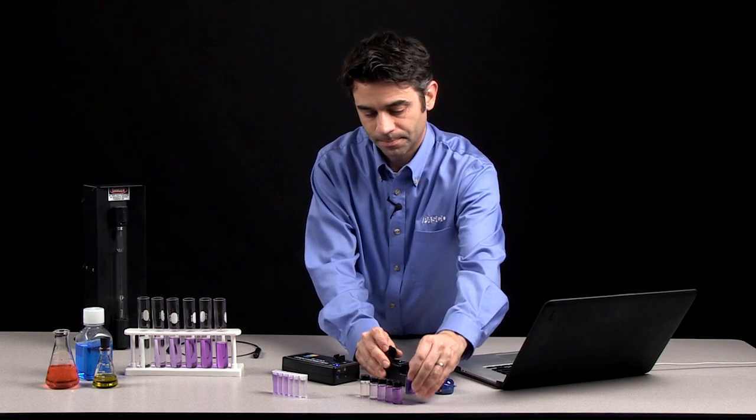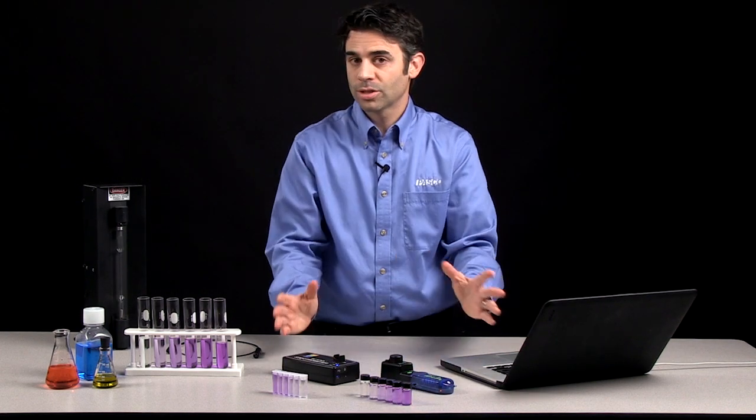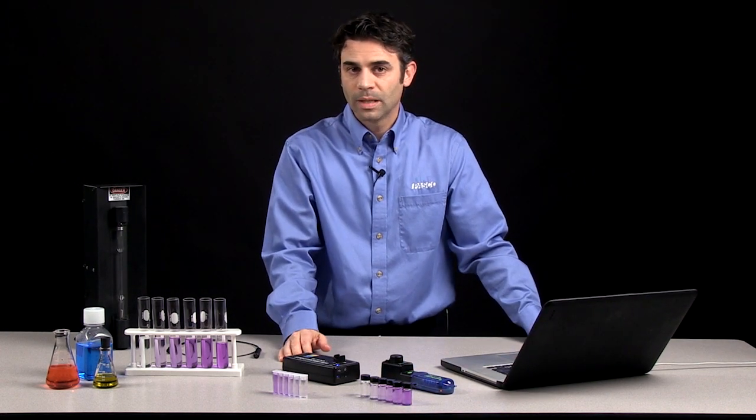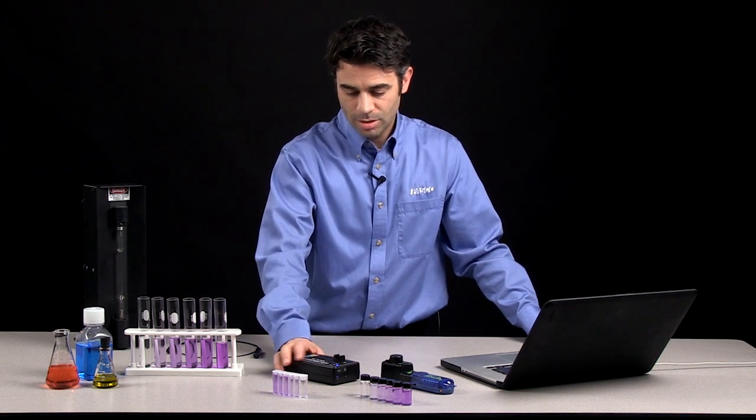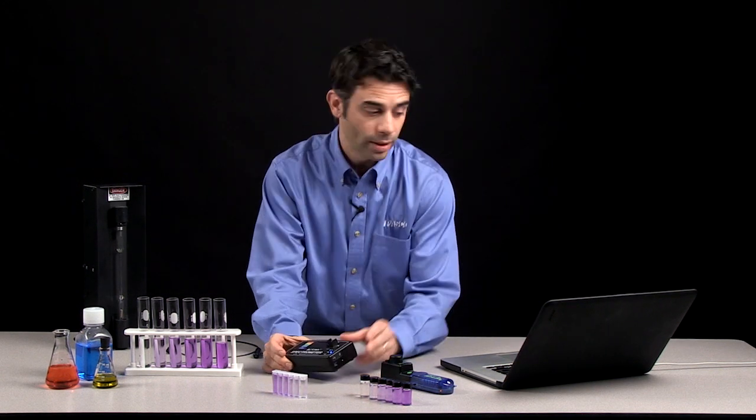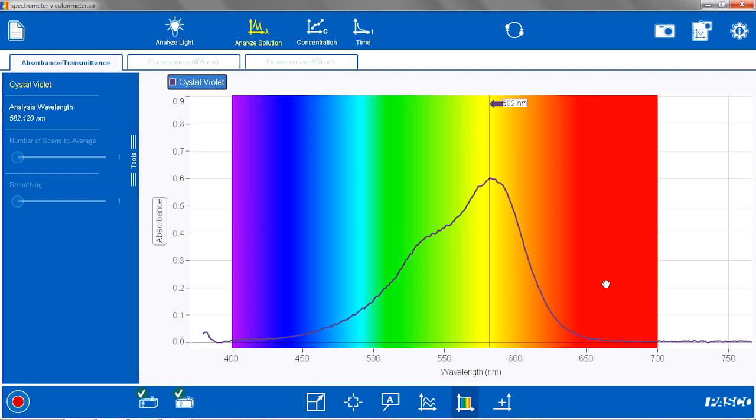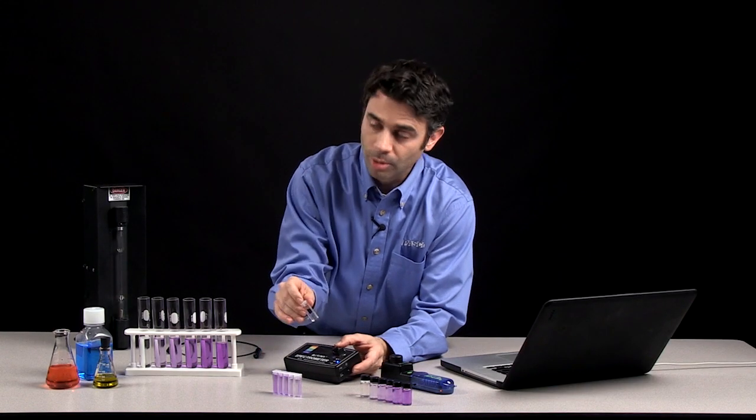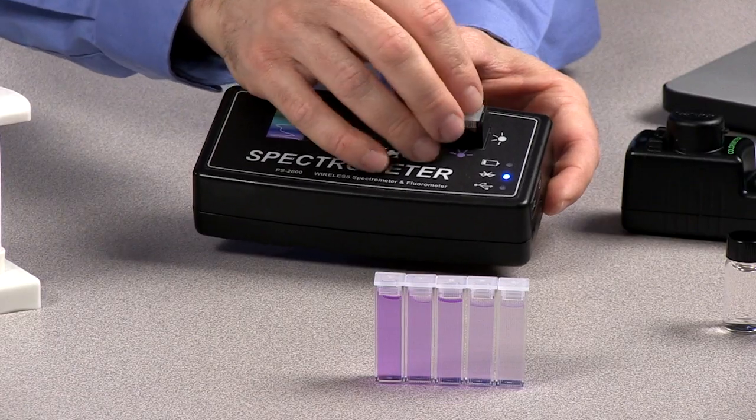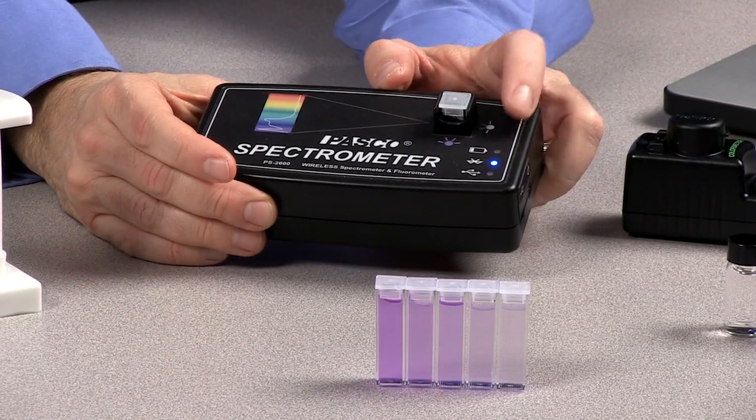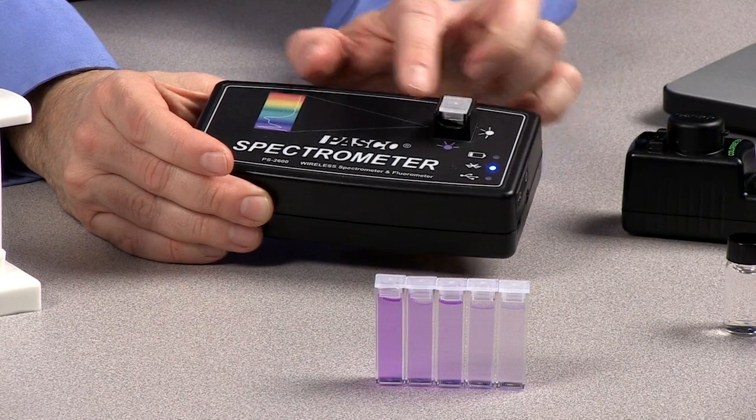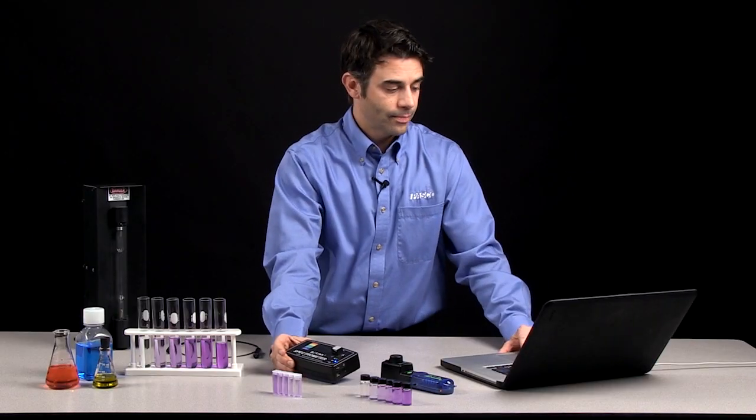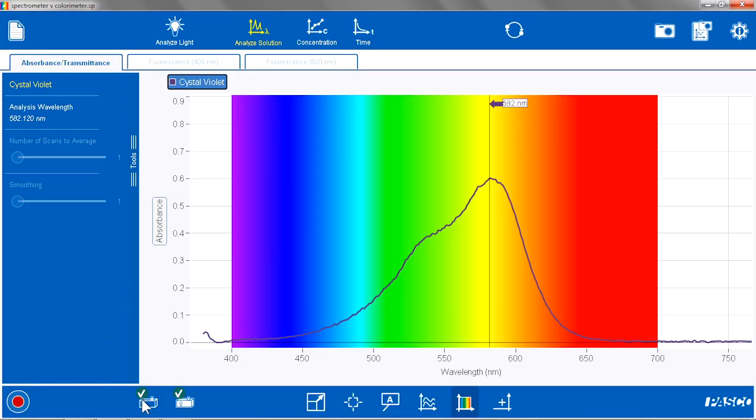For the spectrometer, I can also do an initial analysis of a colored solution. So the spectrometer will work with its own app, called the Spectrometry app. And I would do the same thing I did with the colorimeter. I would blank it using a reference, in this case a water sample, putting it in so that the white light source goes through the sample to the detector. And then I would calibrate my reference, turning the lights on and off.